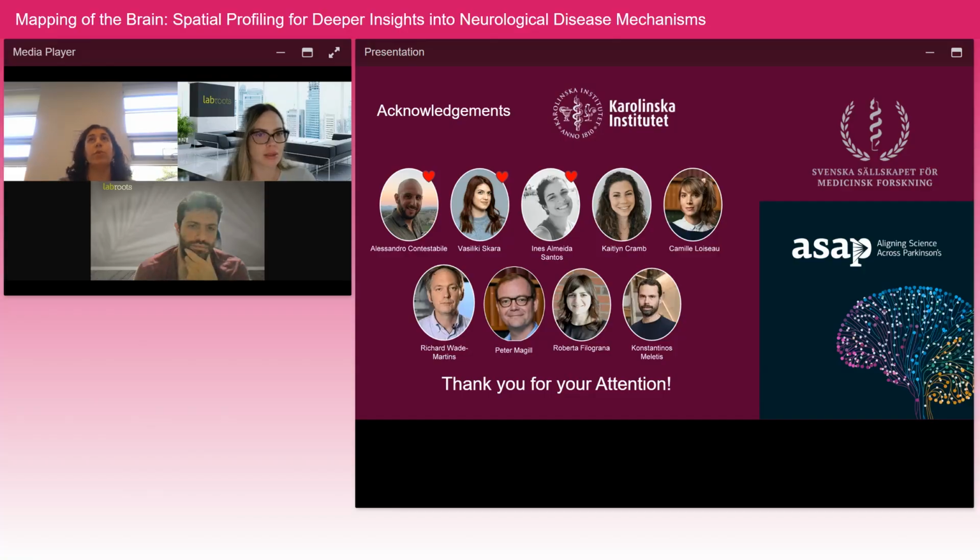It really depends on your question, I would say. I think the easiest course of action is to always look at our pre-designed panels first, because if the genes that you're interested in are in that panel, and most likely they are, then you can go with that and not have any other barriers to starting your experiments.